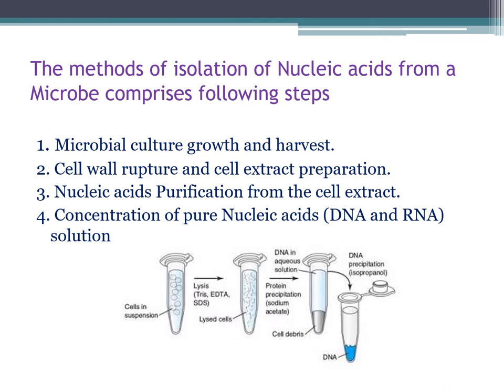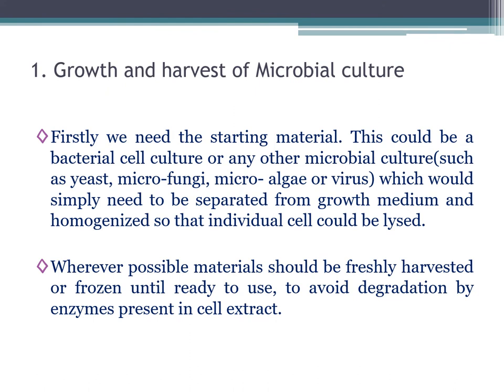In this lecture, we will focus on the first two steps of isolation, that is microbial culture growth and harvest, and cell wall rupture and cell extraction. So, moving forward with the first step, that is growth and harvest of microbial culture.